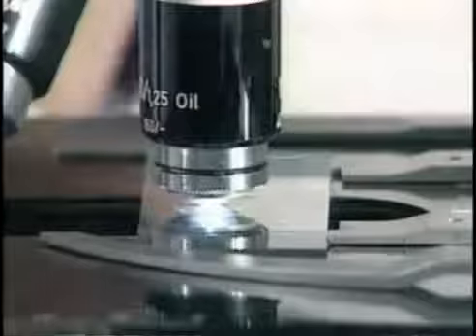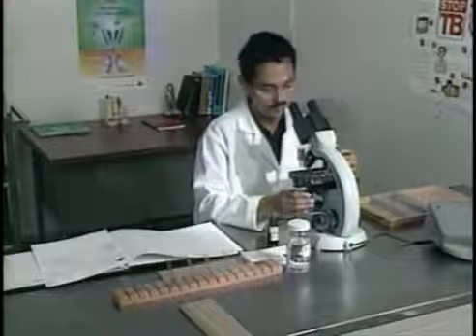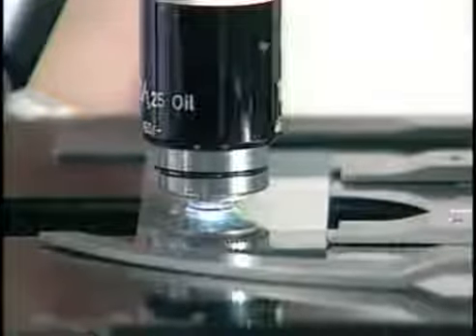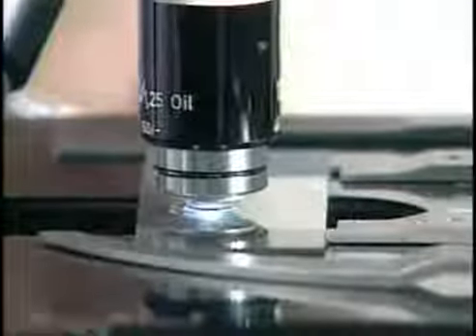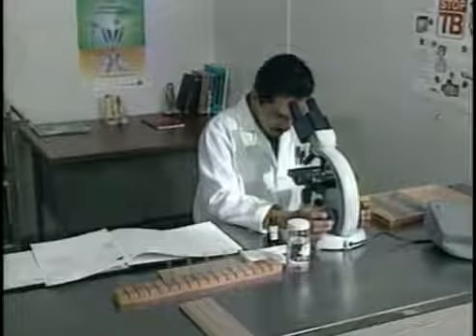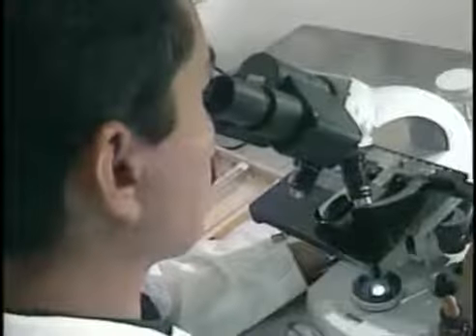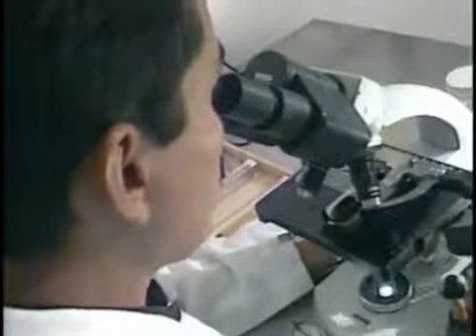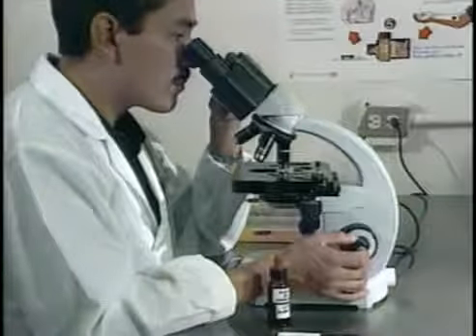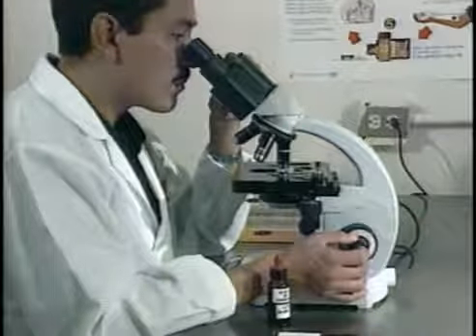Turn the nosepiece to bring the 100x objective into place. Now gently lower the 100x objective. It should barely touch the oil. Never allow the lens to touch the slide. This can damage the lens and possibly break the slide. While looking through the eyepiece, adjust the immersion lens slowly and focus until the image on the smear appears. To fine focus, turn the fine adjustment knob carefully.